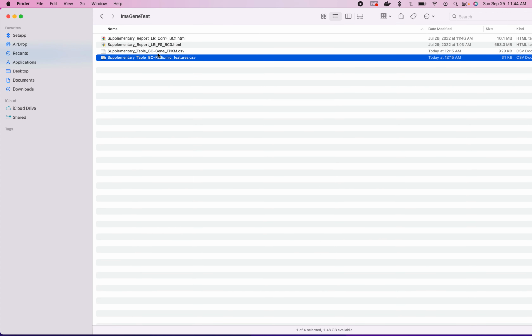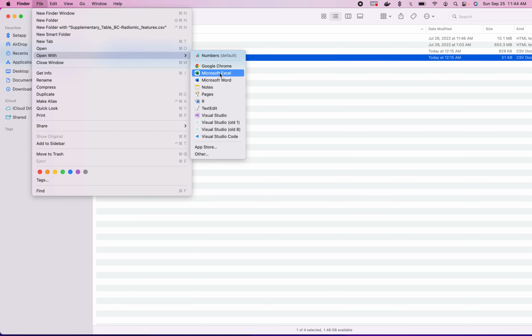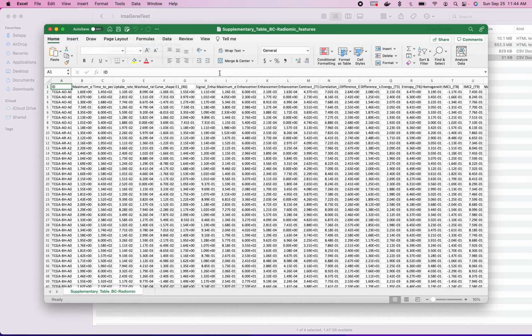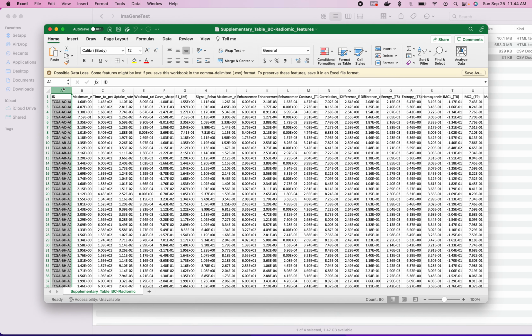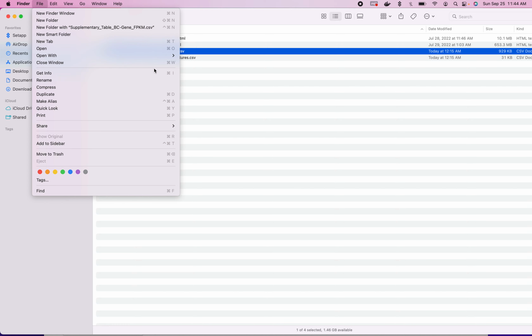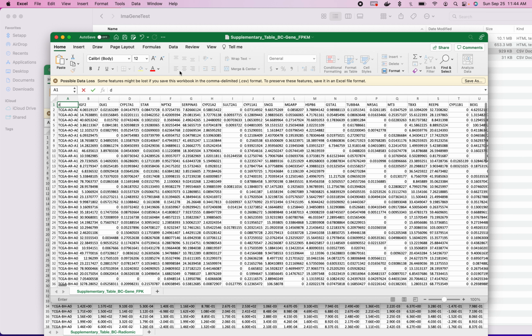And just to allude to how these files look, these are essentially comma separated values that could be opened up in Excel or could be prepped in Excel and stored as .csv, where they have a common ID column between both the radiomic and the genomic or any other omic data file that you want to use. The features could be genes or even patient outcomes that you want to train against.